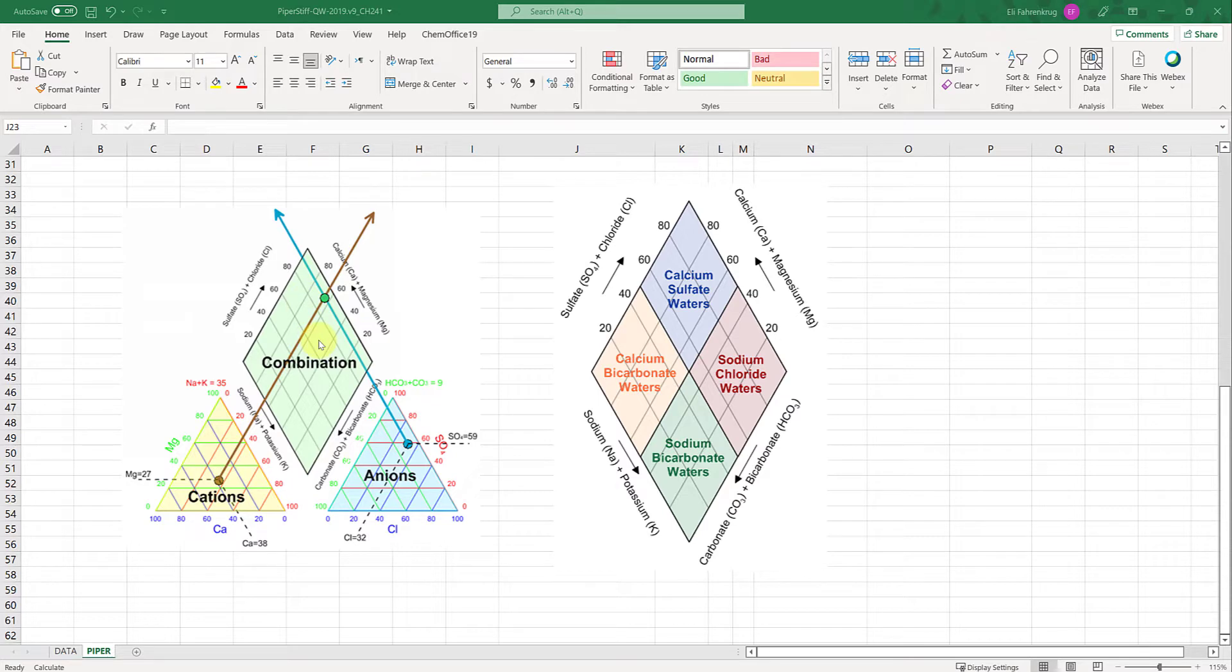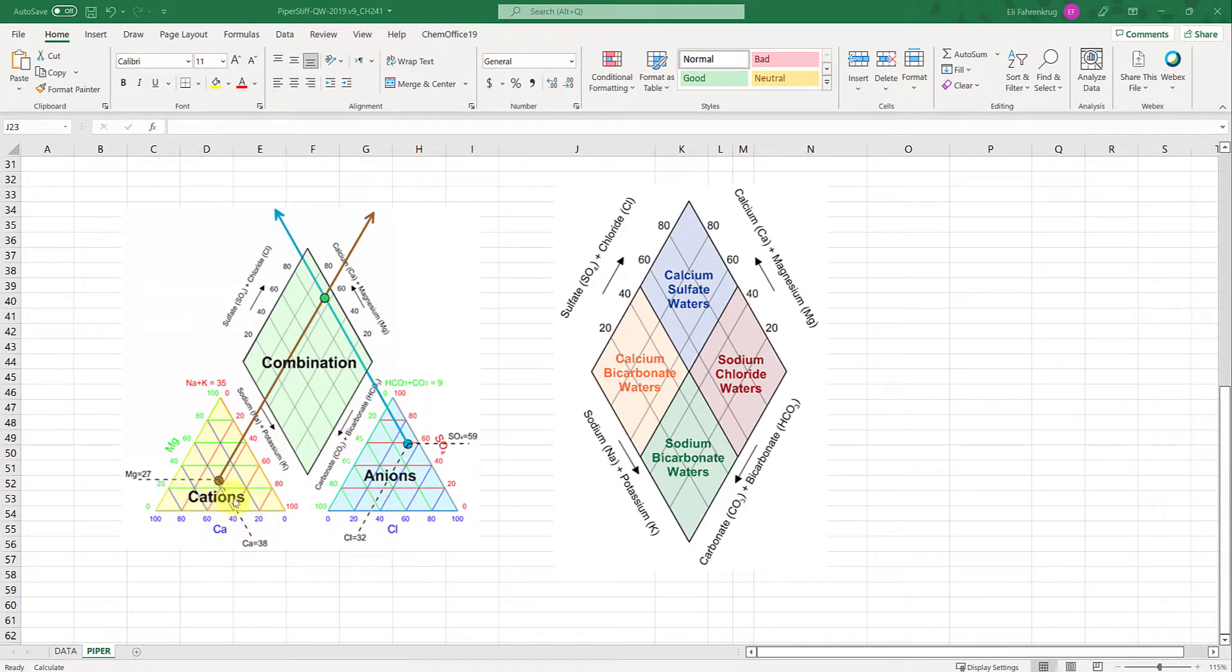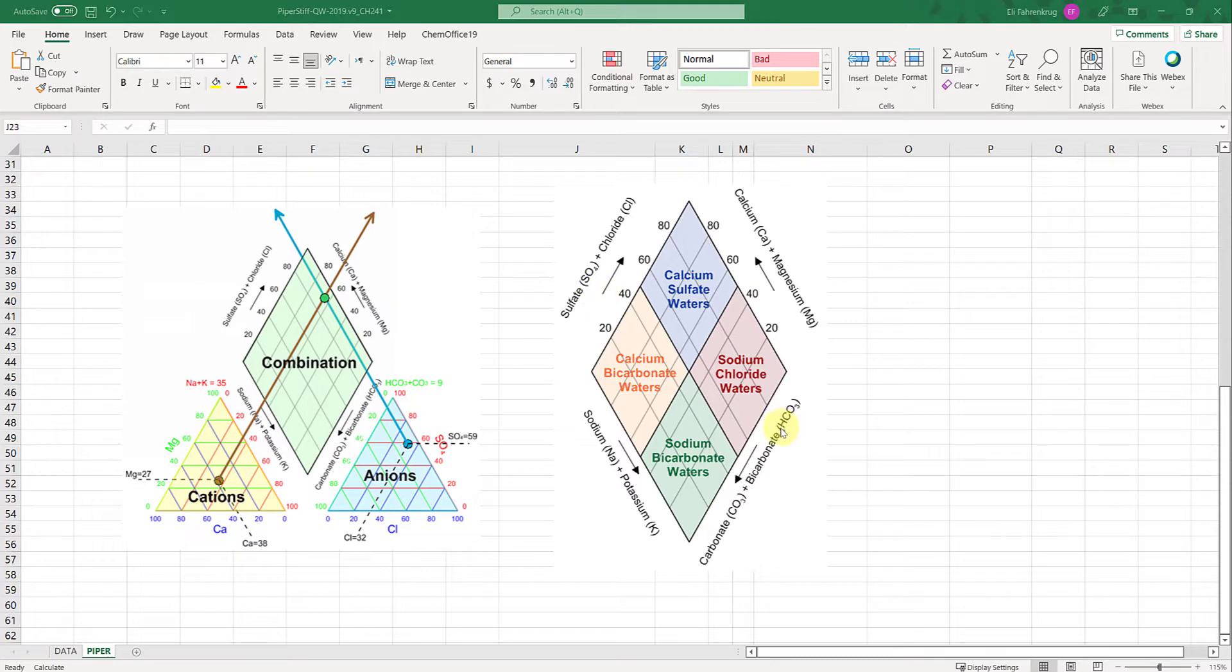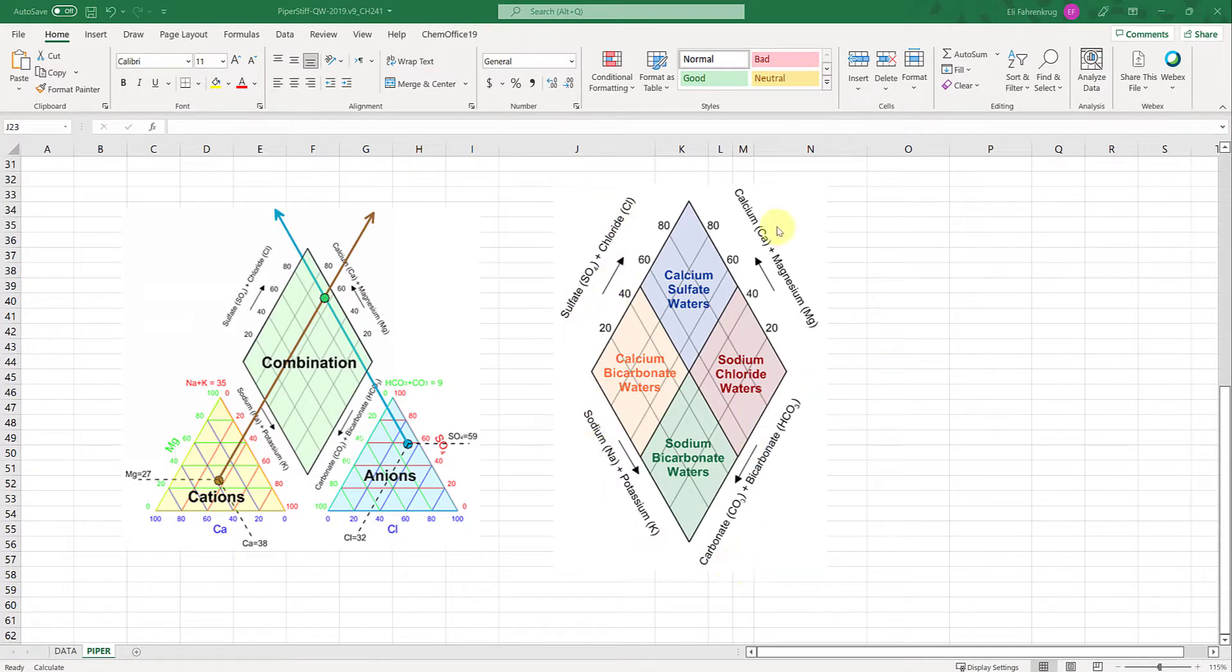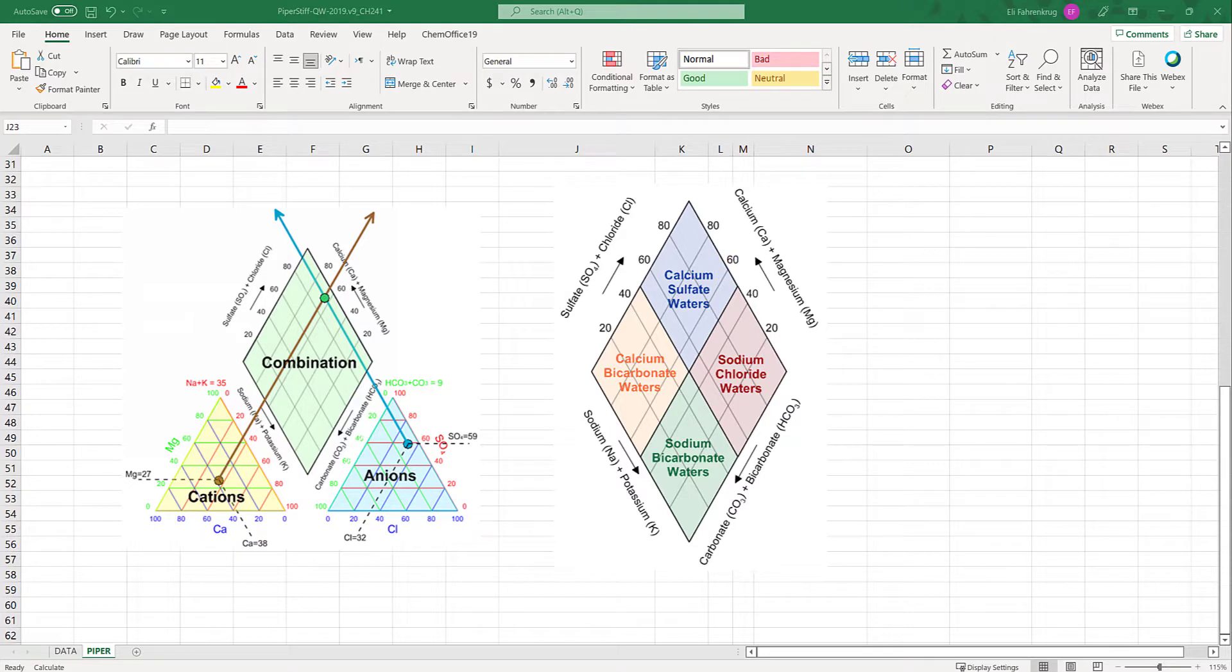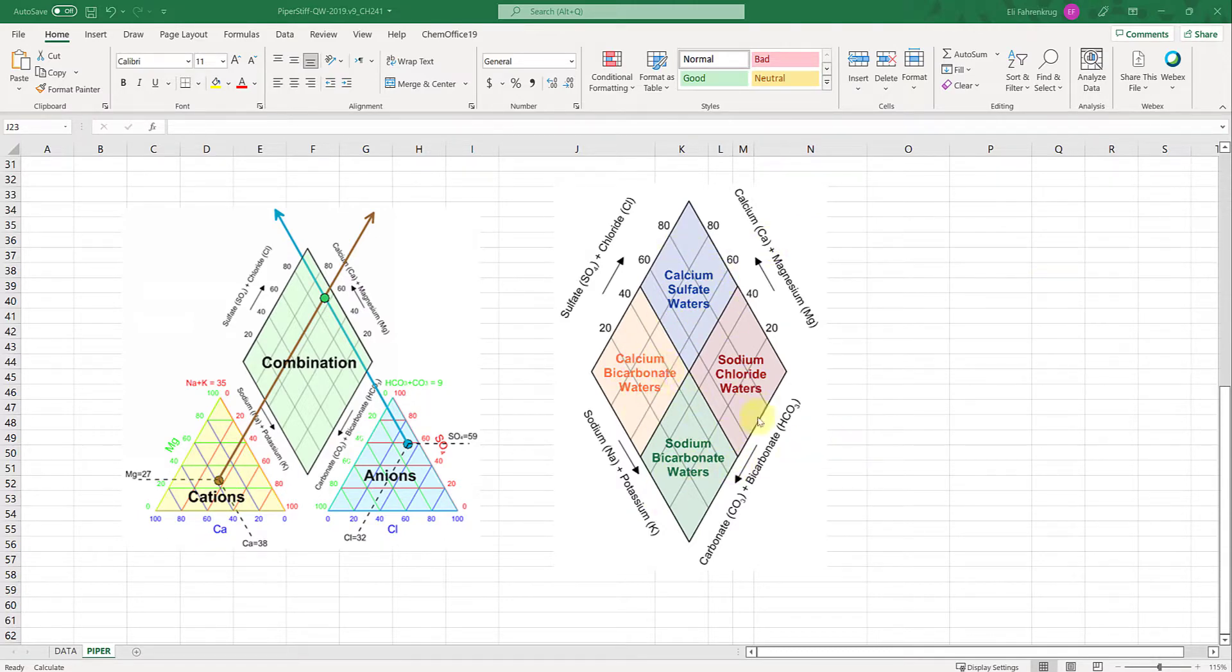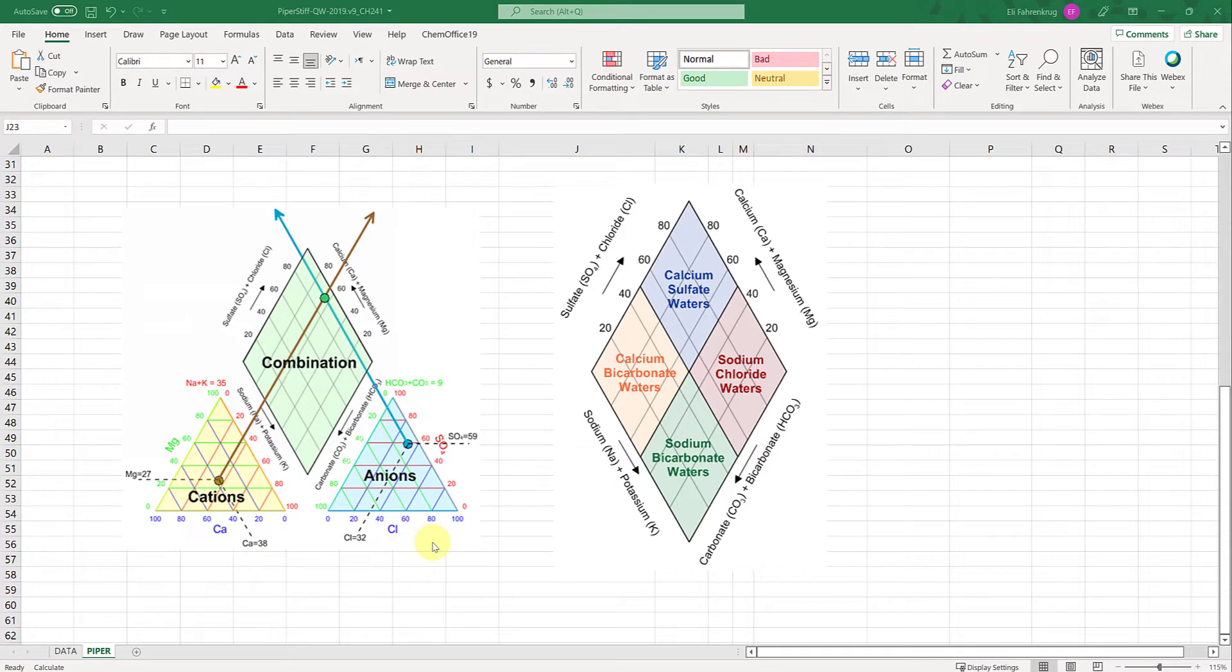If you plot a lot of different samples you see different groupings based on the specific differentiation of cation and anion composition. On the right I have a simple interpretation diagram of the diamond. Depending on where your point lands for that water sample, you can identify these things called chemical facies. It's a clustering mechanism based on the unique character of samples.